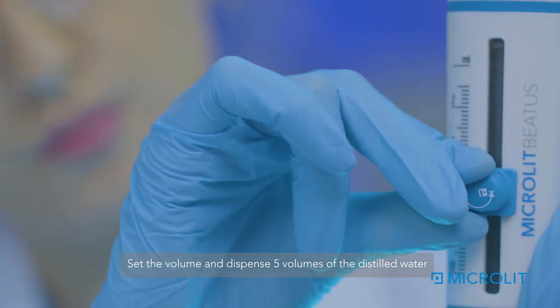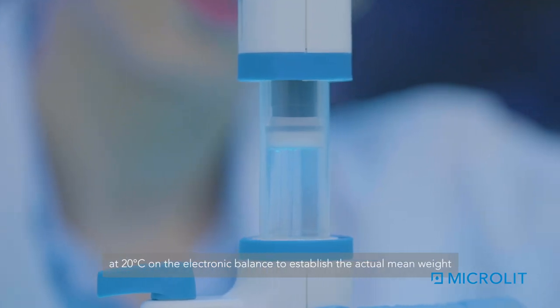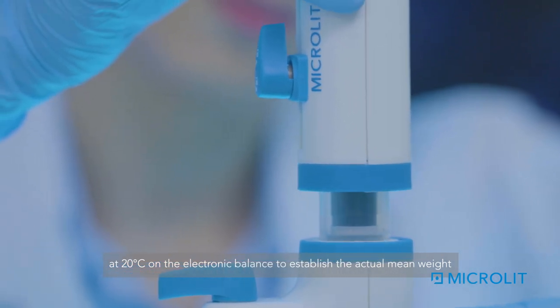Set the volume and dispense 5 volumes of the distilled water at 20 degrees Celsius on the electronic balance to establish the actual mean weight.